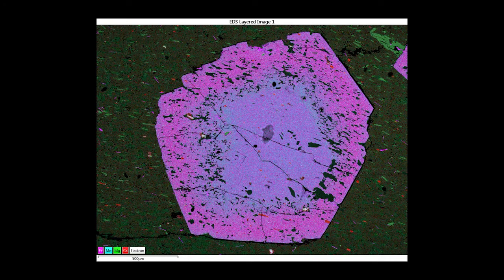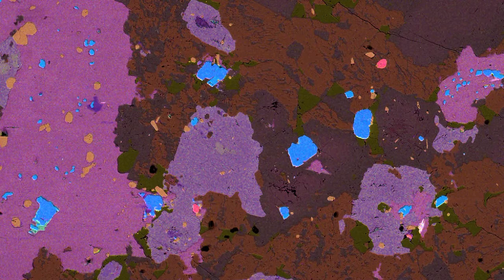So geology majors at Middlebury do a full-year senior thesis, and my research focuses on the origin of a volcano in New Zealand. And I'm using this machine to look at some of the chemistry of those rocks in greater detail than I would be able to get on pretty much any other piece of equipment we've got available. And my project is trying to determine how certain rocks in Maine formed. And in order to do that, you really have to take a look at minerals and mineral chemistry within the rocks. So minerals, just the components of a rock. And the only way to do that is using an instrument like this.